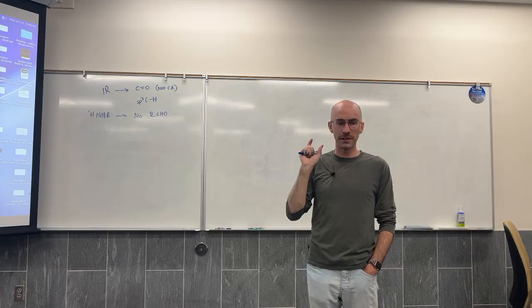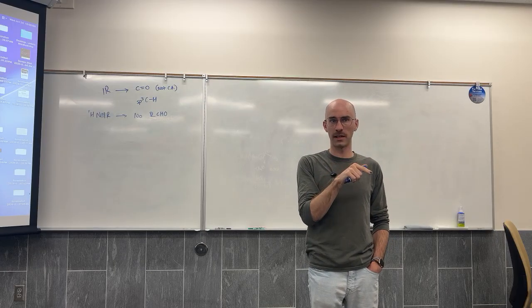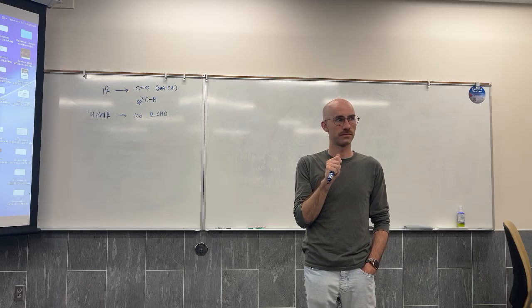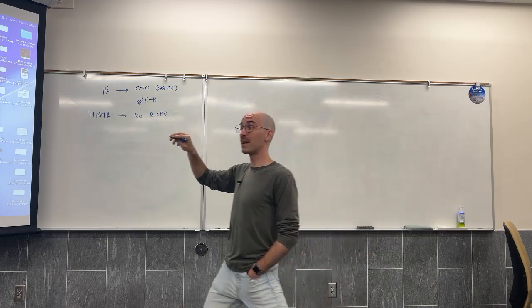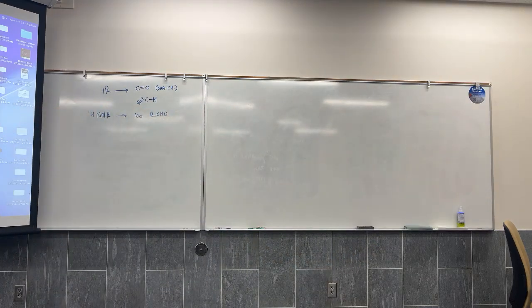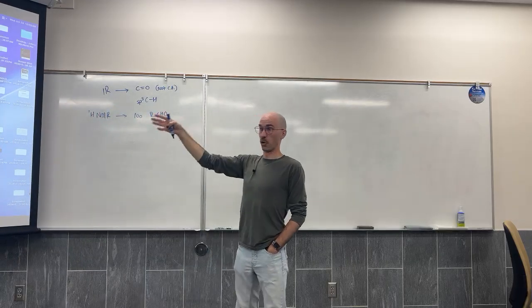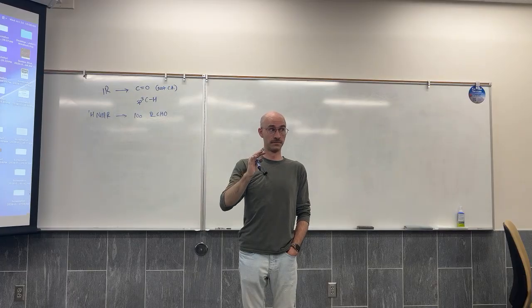Proton NMR tells us there is no aldehyde. Can someone remind us why the proton NMR confirmed that? That would be IR. And we actually felt like the IR, we weren't sure if there were twin peaks. Good. No signal beyond 4.5, let alone a signal at 9 to 10.